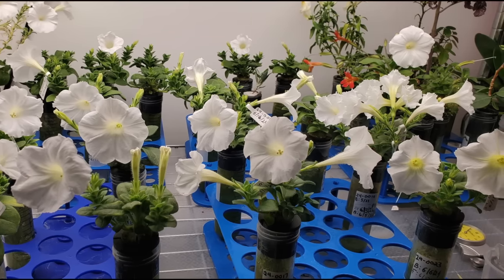So like I said before, a gene gun is a genetic shotgun where you take your DNA and coat it onto these little nanoparticles of gold or tungsten. I use tungsten. I'm not a rich man. I also don't feel sane shooting gold and then throwing it down the drain. That's nuts. So I have these tungsten nanoparticles. They're about 800 nanometers wide, right?